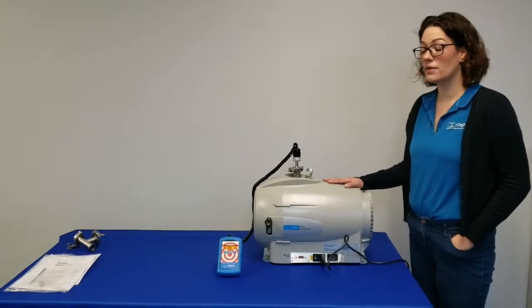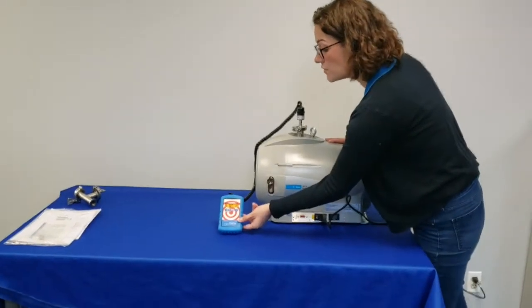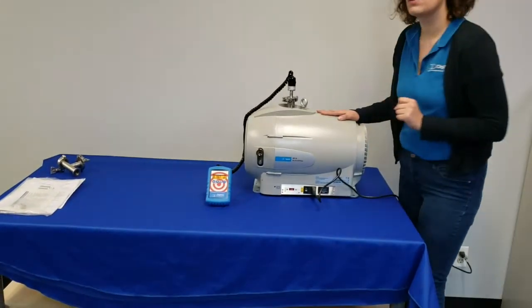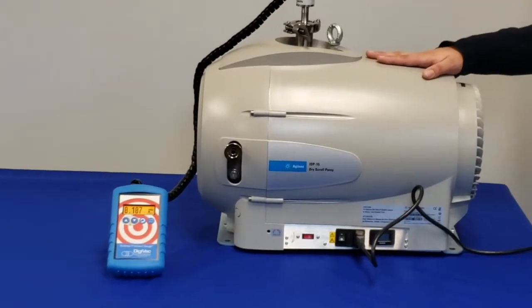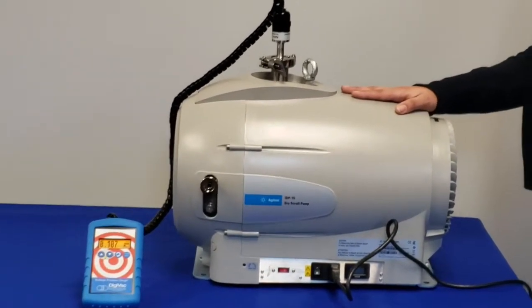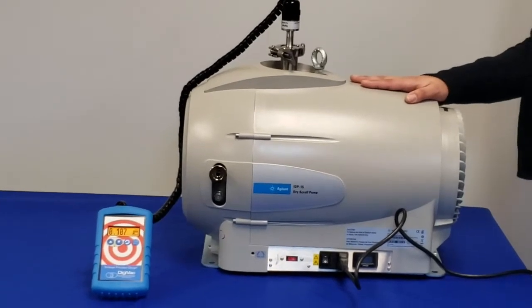We've had our pump running for approximately 3 minutes with our Digivac Bullseye precision gauge hooked up, currently reading 107 mT. Typically, within several minutes, you can expect to see pressures of between 60 and 150 mT on first use, so we're well on our way.